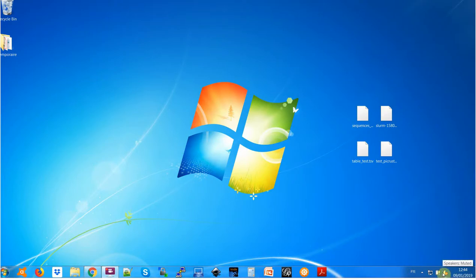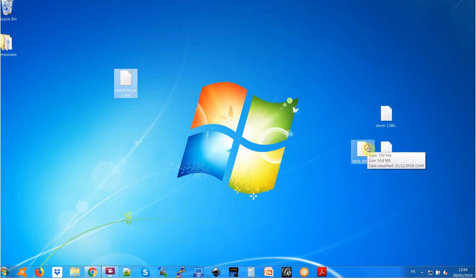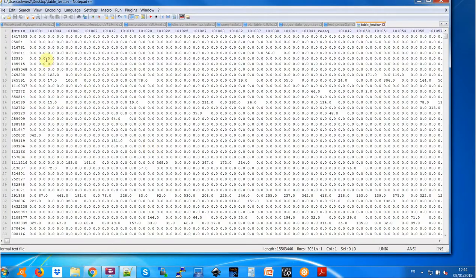Hello, so today I will just have a quick demo on how to, from a table of 16S, make an inference using PyCrust2. And to do that you will need basically three files. First will be the fasta sequences right here. Then you will need your table, so I can open it so you can see how it's presenting itself.